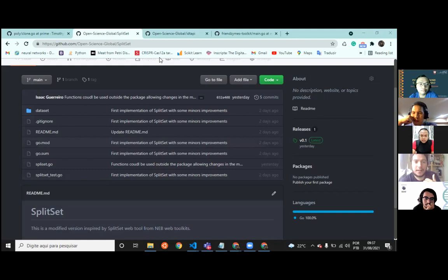And if this takes much longer than needed, you try to make some heuristics to not select some space of possible sequences in this type of problem. For example, we could try to see how the design is made by people and translate this into programming, to make the same thing that they do. And this is almost what we're doing in Friendzymes.